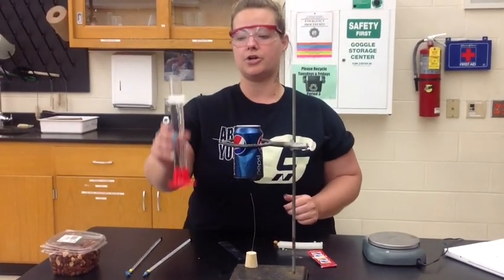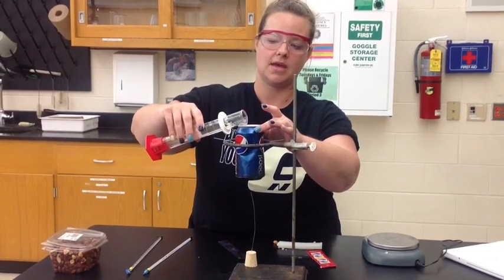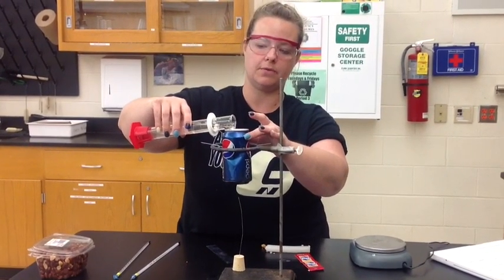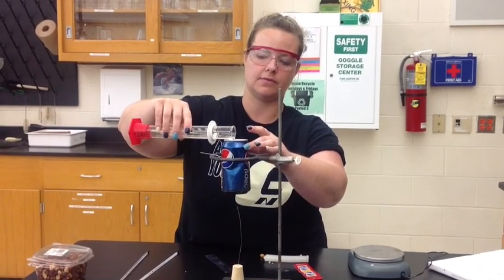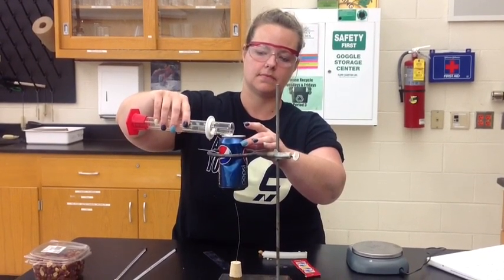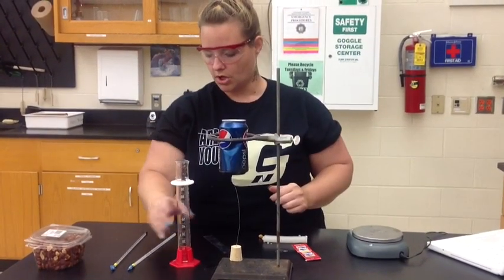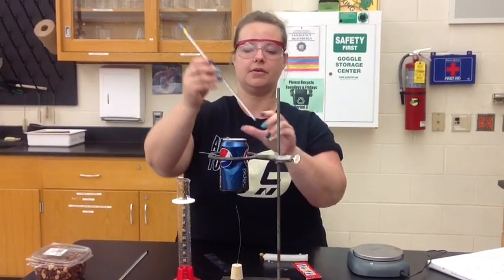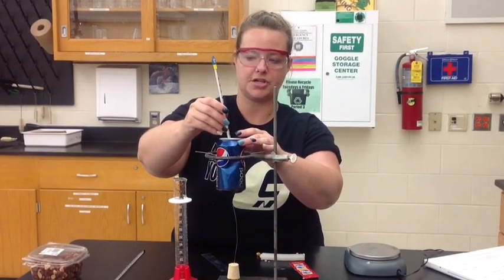You're going to need 100 milliliters of water that you will pour into your can. The water temperature is what you will be recording initially and then after the food source has burned. Go ahead and place a thermometer into the can and let the thermometer adjust to the temperature.